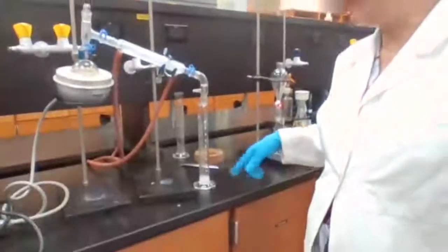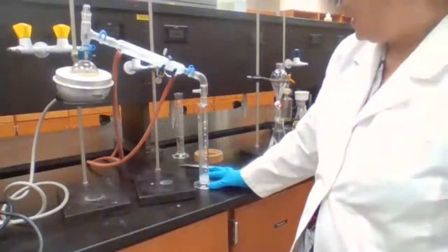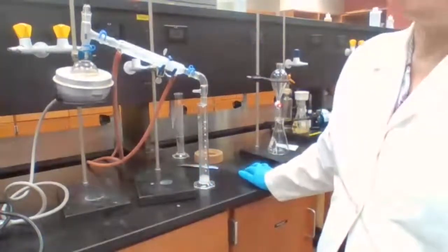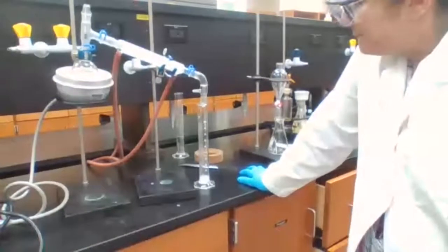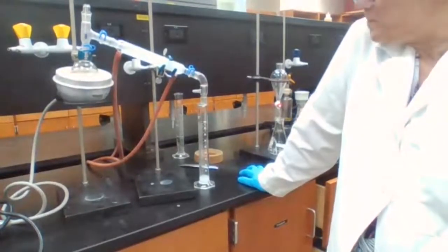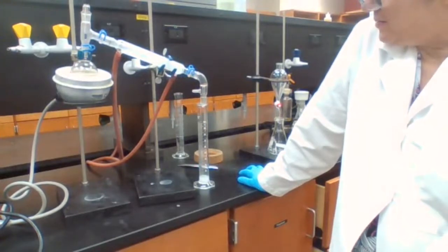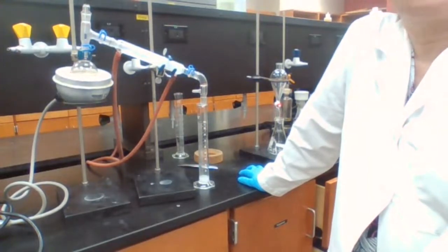You see the receiving. And can you tell me why it's cloudy? What you are receiving in the graduated cylinder now is cloudy. Can you tell me why it's cloudy?